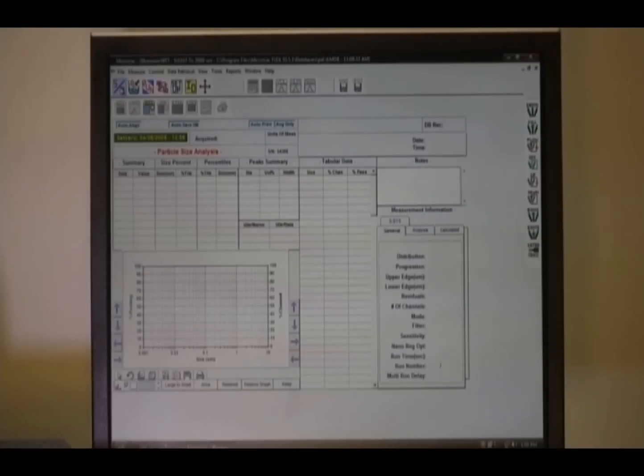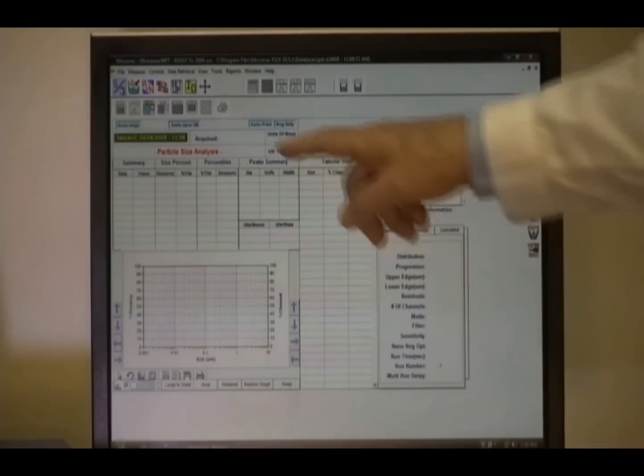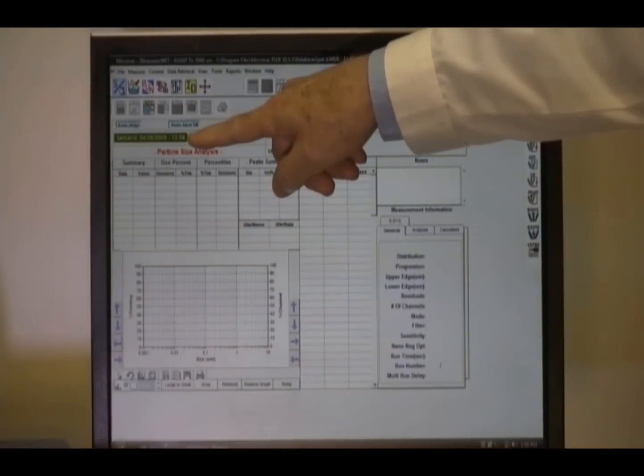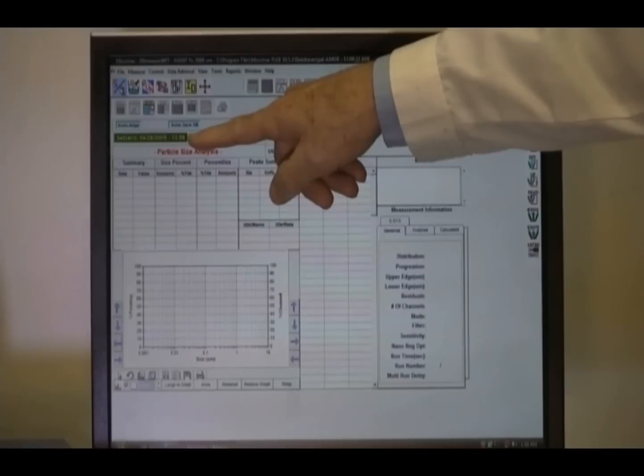Upon completion of the set zero and alignment, if it is successful, it will show a green bar at the left-hand side of the screen. This shows the date and the time of the set zero and shows that all the background information is well within specification. If this were a poor set zero, it would be shown as red.